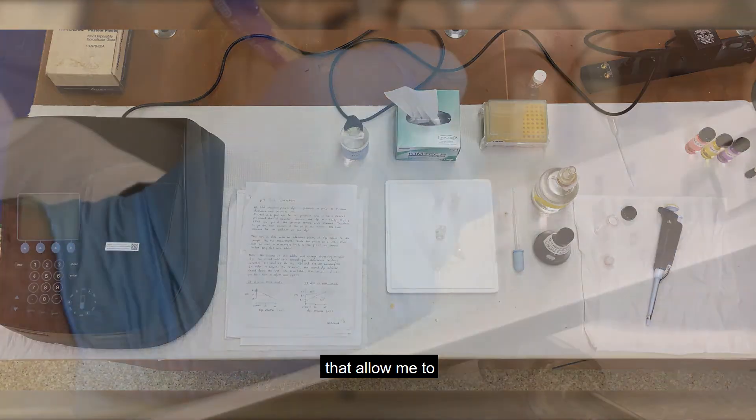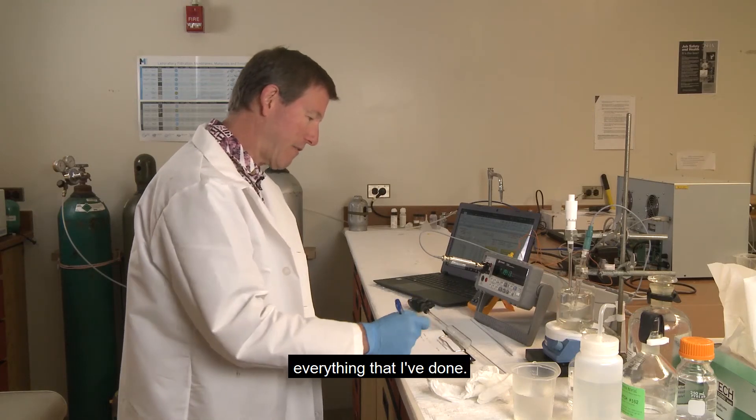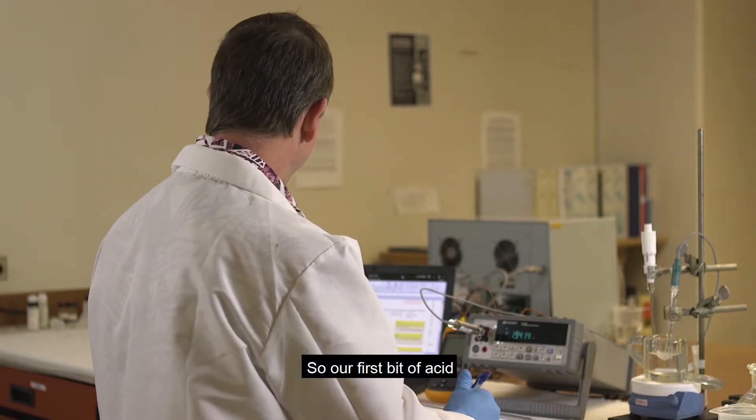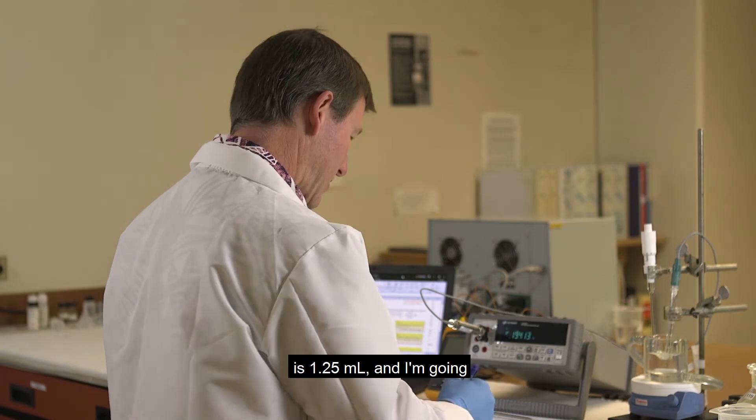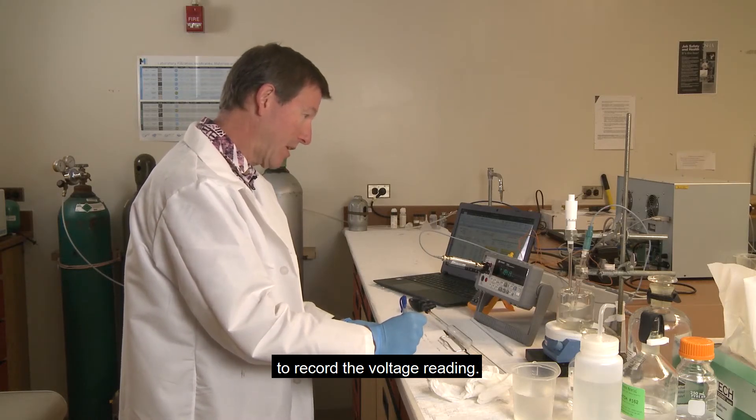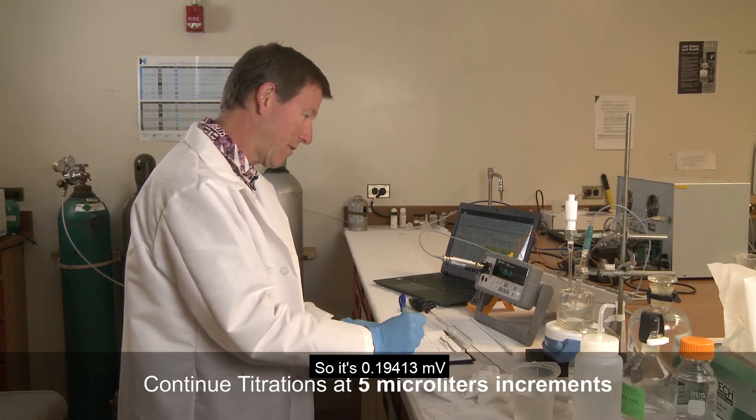I have these alkalinity sheets that allow me to keep a record of everything that I've done. So our first bit of acid is 1.25, and I'm going to record the voltage reading. So it's 0.19413.